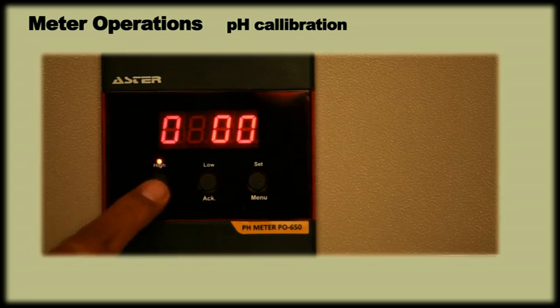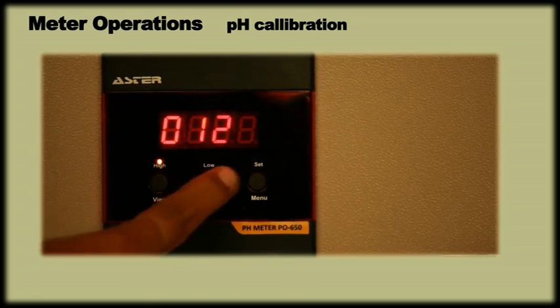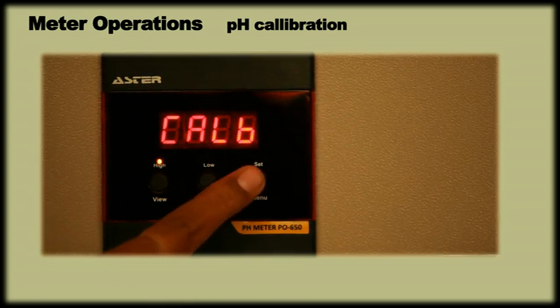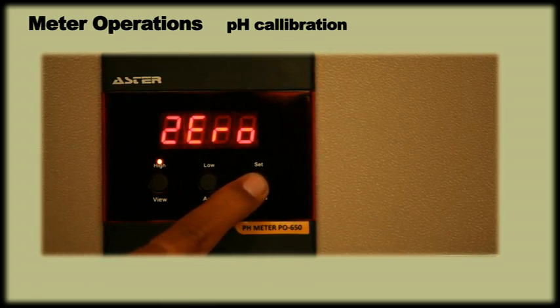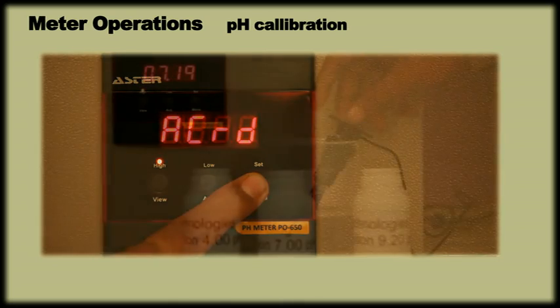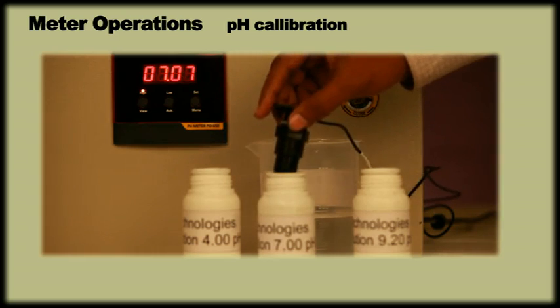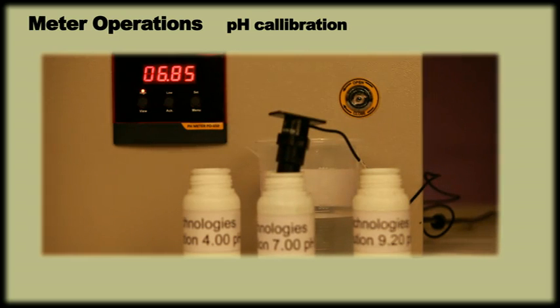Enter password 123. The display will show calibration and on pressing menu, display will show 0. On pressing menu again, the display will show ACRD. That is the actual reading sensed by the sensor.